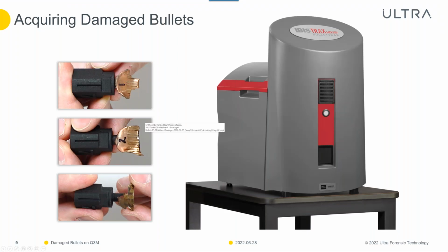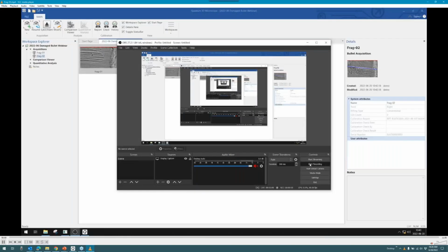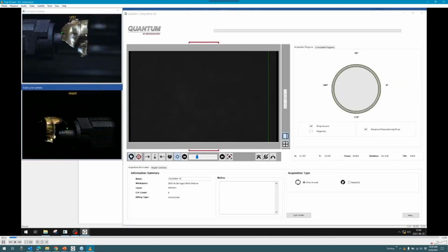So number 1 is in, number 2 is in, despite the warped bends in the metal. Number 3 still has curvature to it, but it is no longer the original cylindrical curvature from where it left the barrel. It's actually had some impact, and we'll see what effect that has ultimately as we acquire this one.